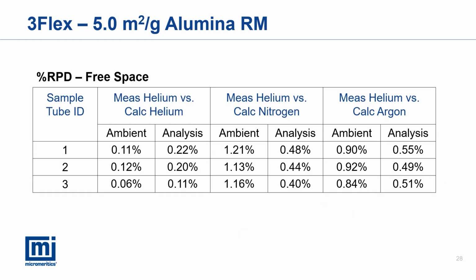The measured free space values obtained during the reference material analyses using helium were compared against the calculated free space measurements, and we see once more the relative percent difference for all values is around 1% or less.